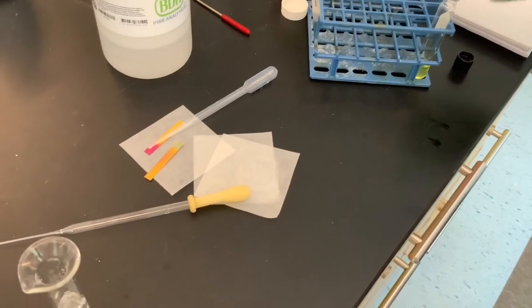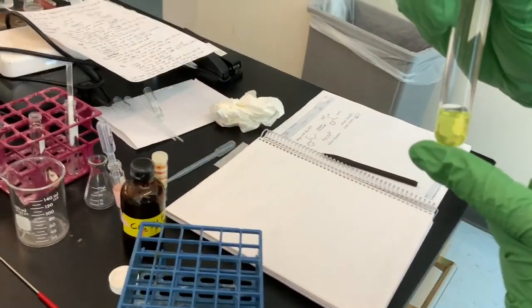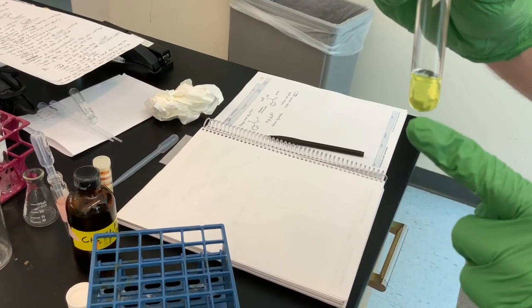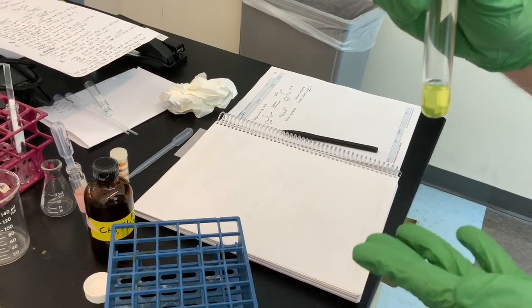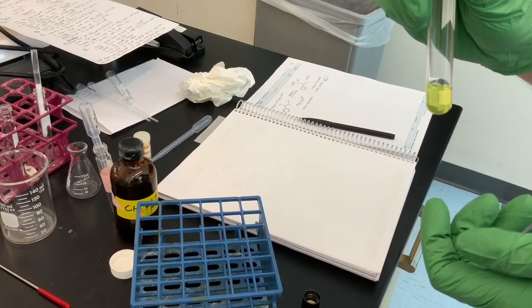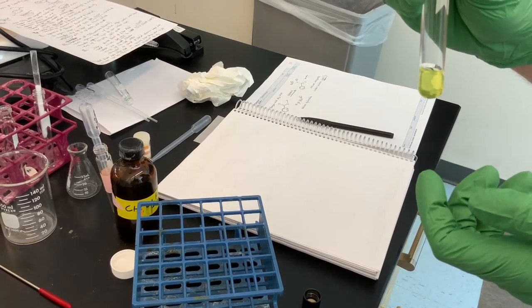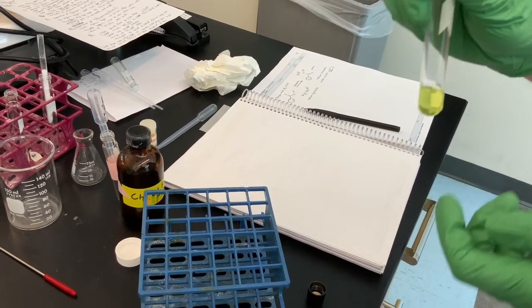Okay, so now that we've separated the benzocaine, all that's left in our organic layer now is 9-fluorenone and benzoic acid. So we already know how to separate benzoic acid from methylene chloride. We use base. In the partition coefficient experiment, we used a saturated solution of sodium bicarbonate. Here we are going to use 3 molar sodium hydroxide.